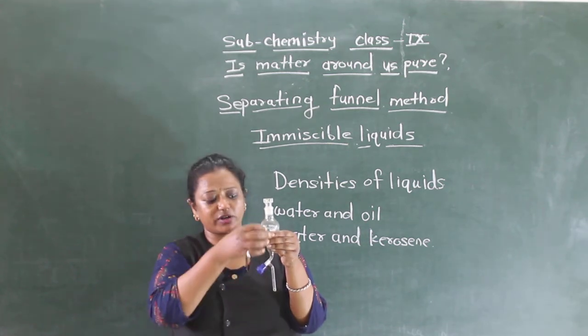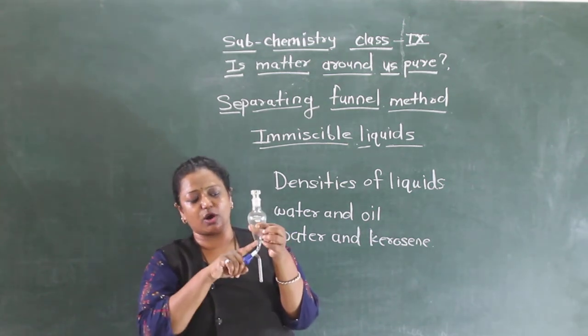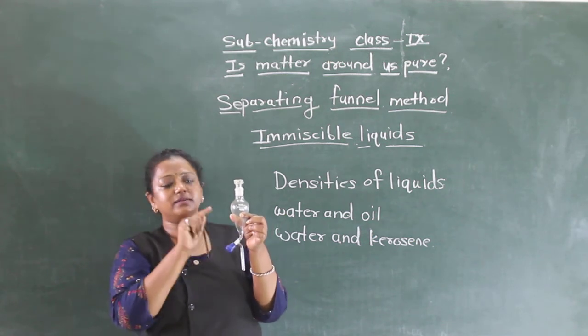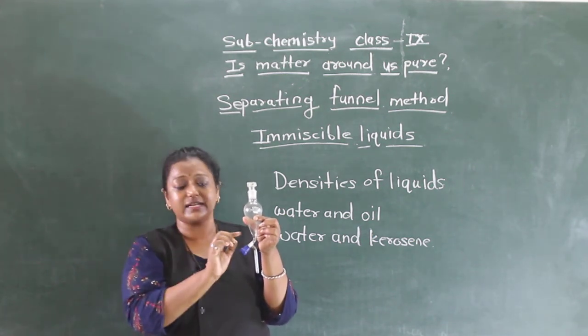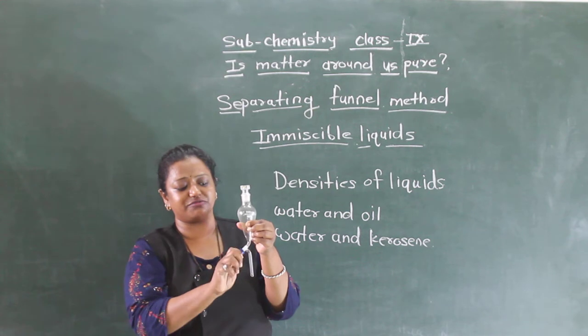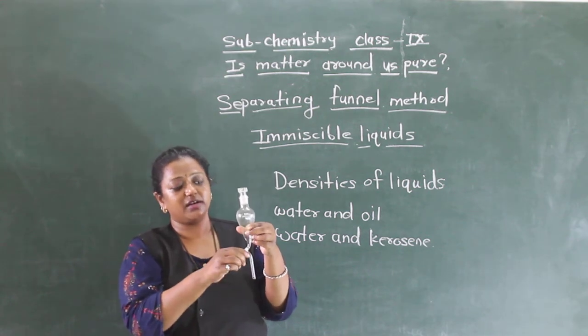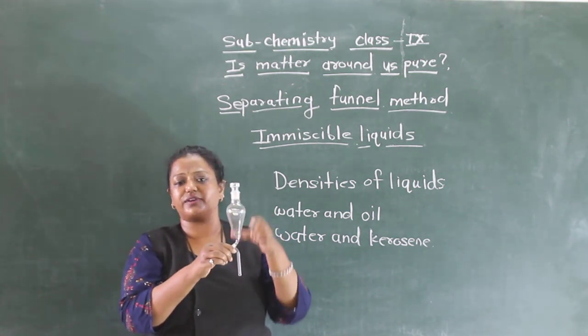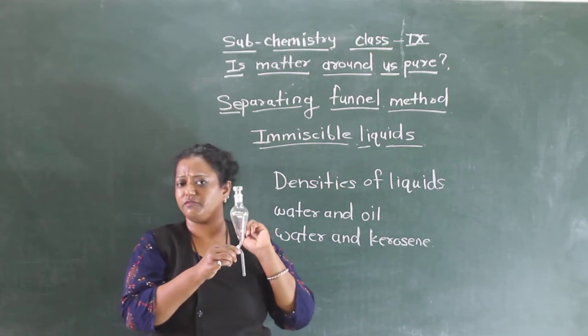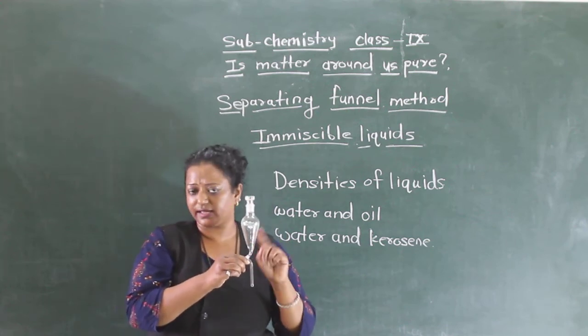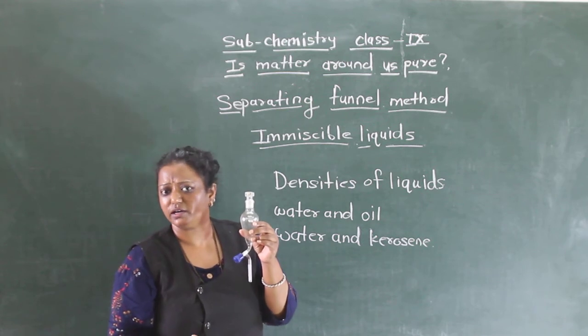The water will come out first and when the layer of oil starts coming, we will turn off this knob. So here we can see two different liquids now. Here in the separating funnel, we have oil and below we have separated water.